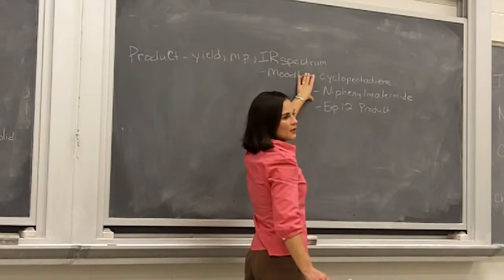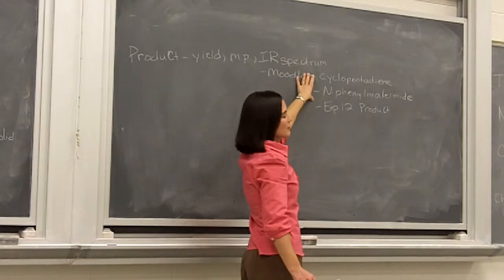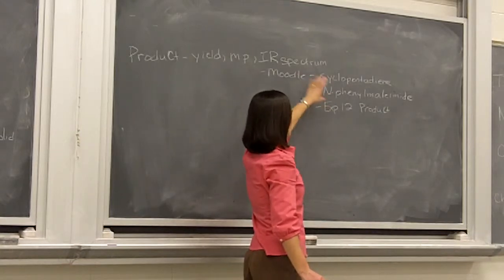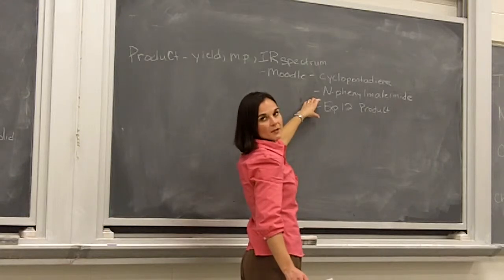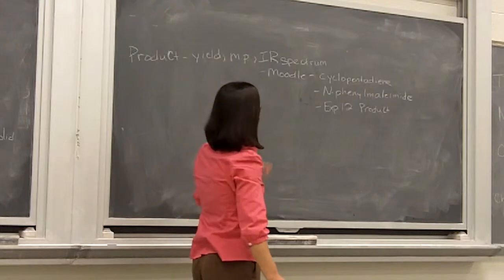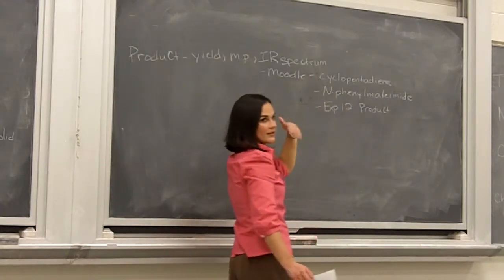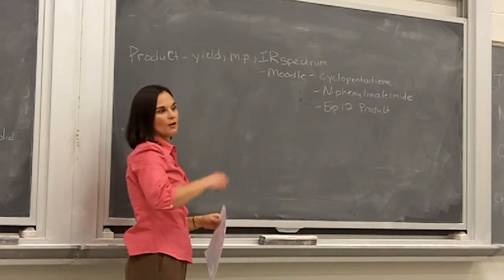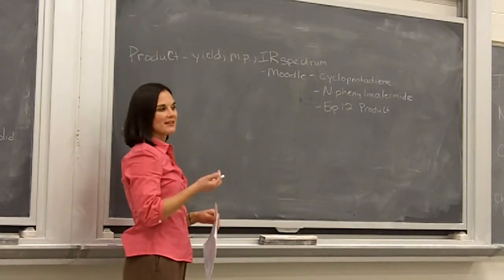When you have starting materials, you want to compare what is similar but also what is different of your product versus those starting materials, and then hopefully your product looks very similar to the experiment 12 product, okay? There is possibly impurities in the starting material, so when you are listing all the possibilities for what those IR peaks represent, make sure that they make sense.